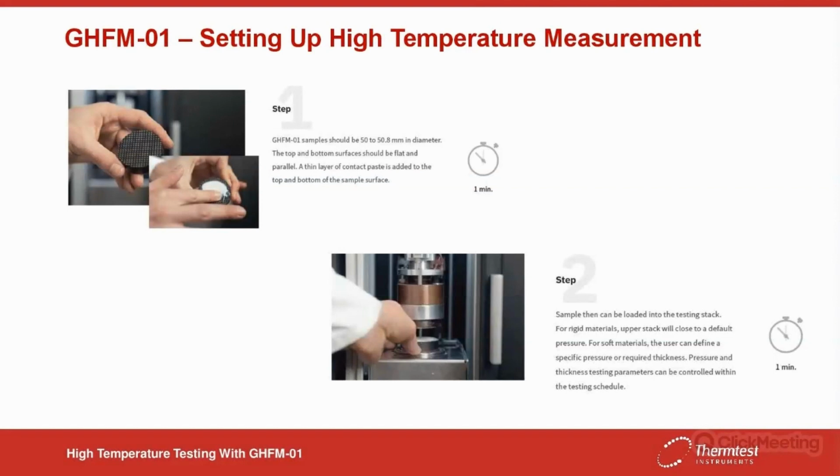That thickness measurement is pushed through the software into the final calculation of thermal resistance and thermal conductivity, so that when you introduce your sample with paste applied, the actual thickness of your sample is what's used, not sample plus the paste, because that does add a little bit of thickness. So for accurate results, that's the initial step.